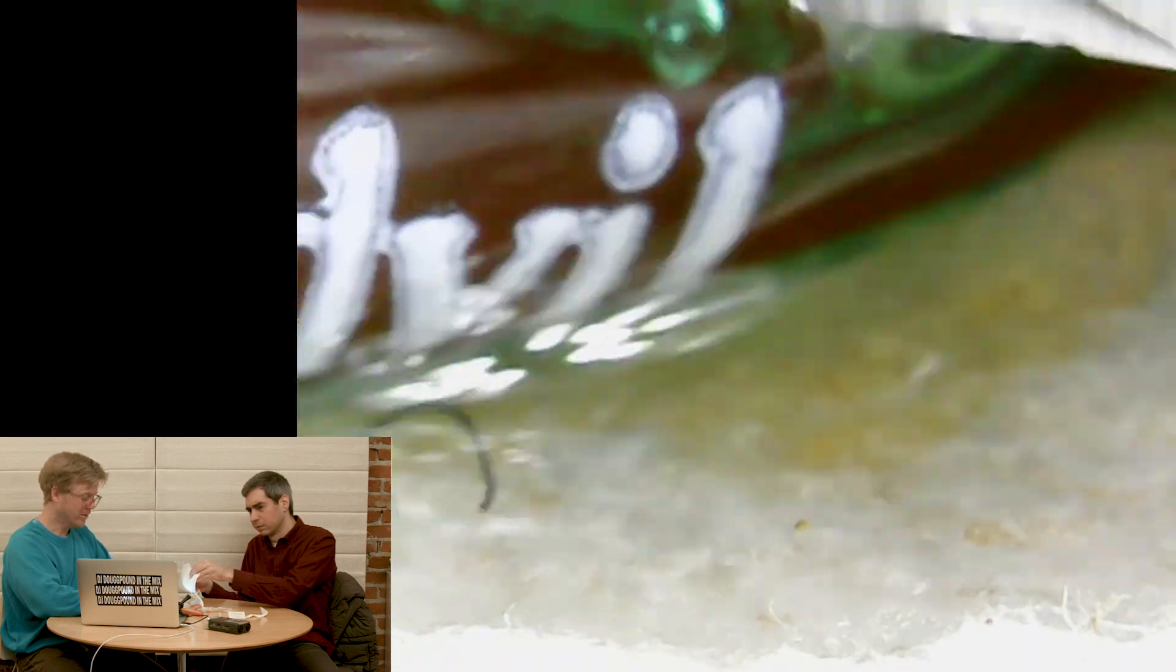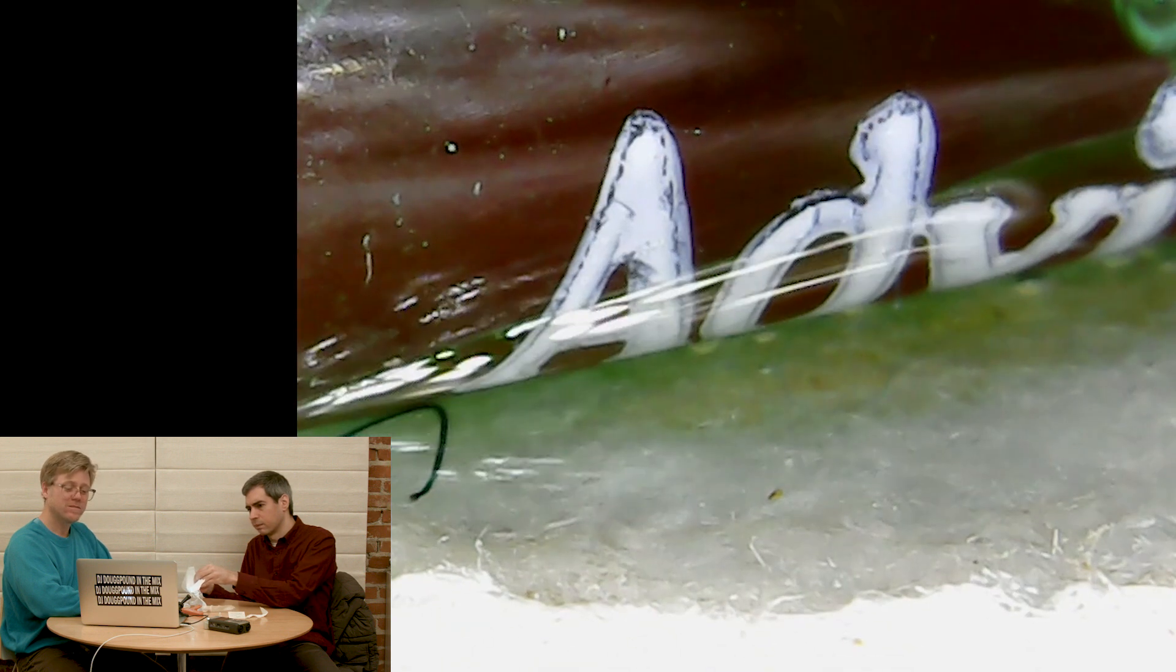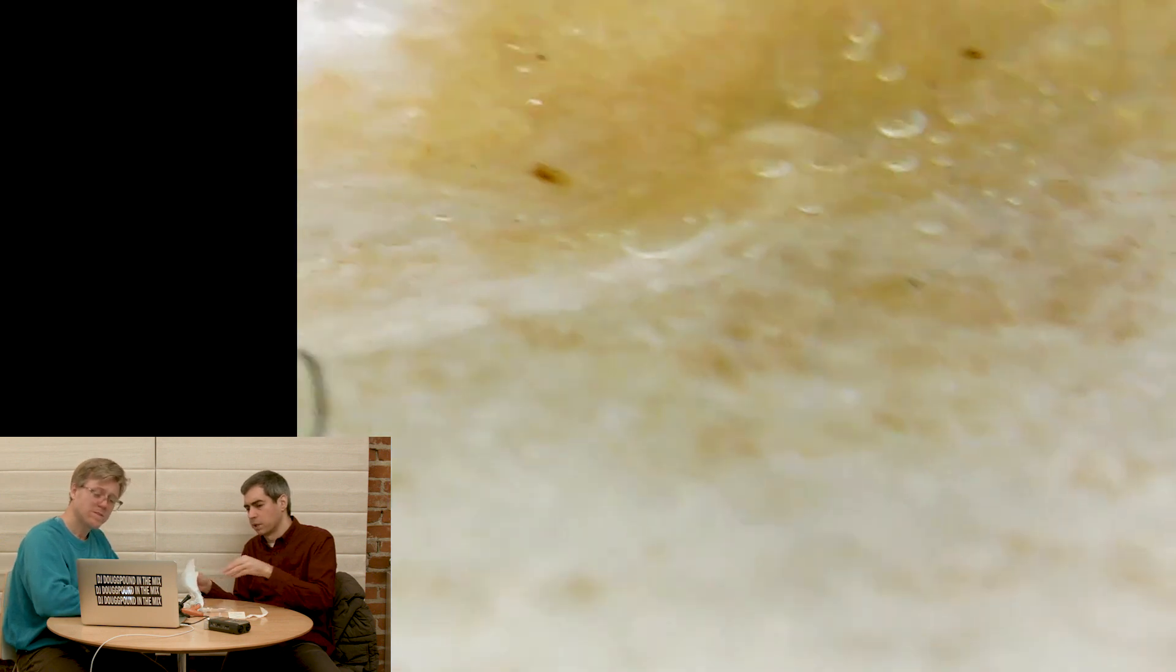It's just fluid. It is just fluid, but it is colored. It's clear, actually. Oh, that's the, I'm seeing the table. The fluid is clear. Right.